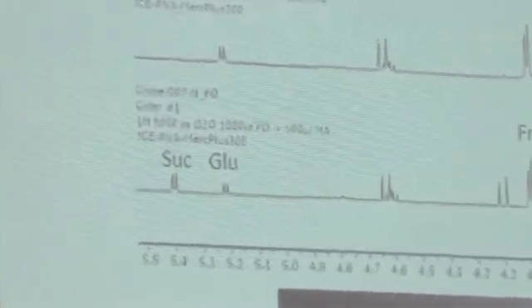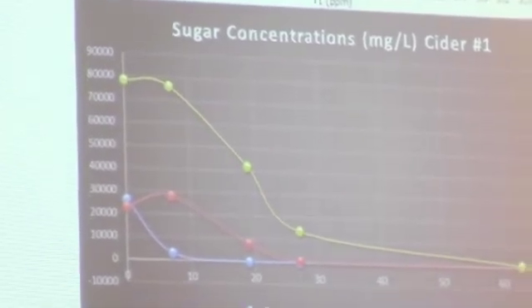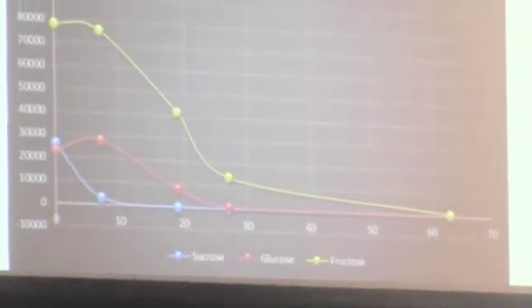So this was the nutrient depleted sample, from the beginning of November to the 5th of January, and you can see what happened as time went by. This is a plot of the fructose, the glucose, and the sucrose. You'll see that the amount actually went up, because the sucrose is glucose and fructose stuck together, and the yeast inverts it and splits them apart. It doesn't actually eat the sucrose, it eats the glucose and the fructose.